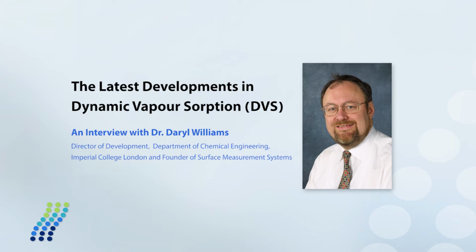The dynamic vapour sorption method is actually a gravimetric method. That is a technique which involves measuring the change in the sample mass. In the DVS method, we expose the sample of interest, a powder, fibre, or indeed film, to a different humidity. So by changing the humidity, we look at the way the sample mass changes with time for a particular humidity.